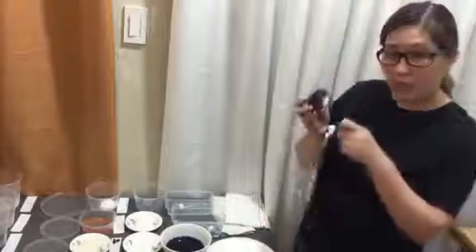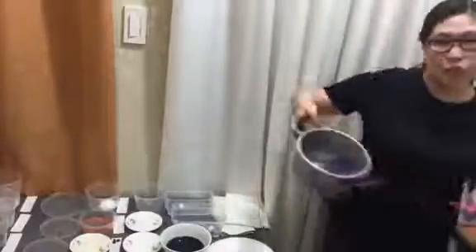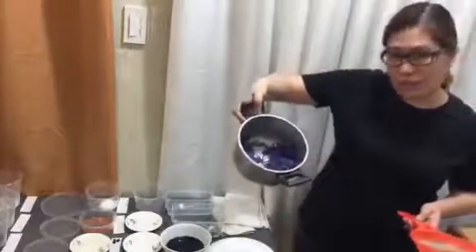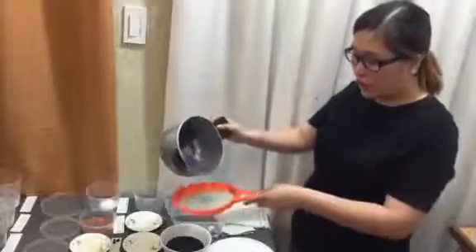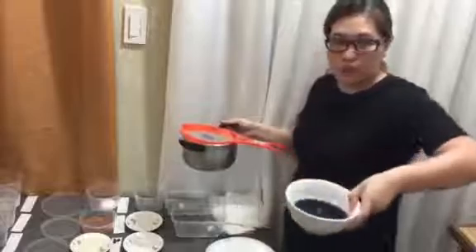The procedure for this activity is, first, number 1, take a red cabbage and slice it into small pieces. For short presentation purposes, I already cut it into small pieces and boiled it in hot water for 30 minutes, and it will turn out like this. You have to drain it to make this red cabbage juice.